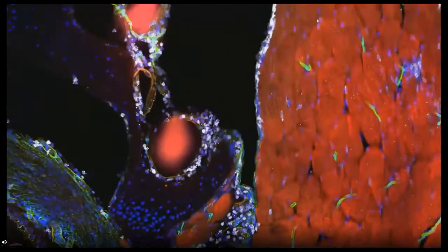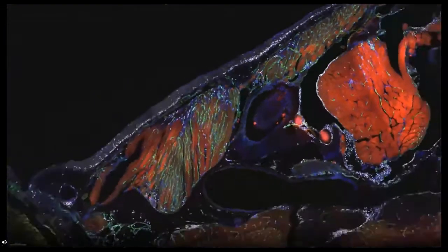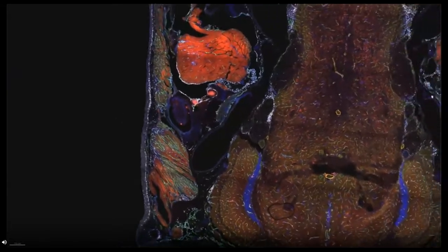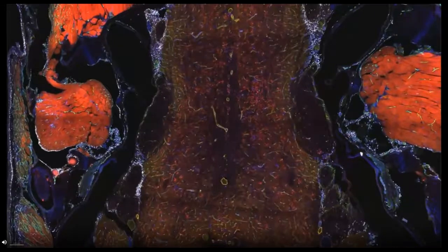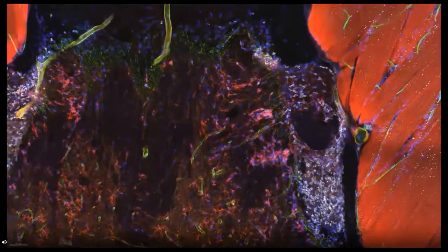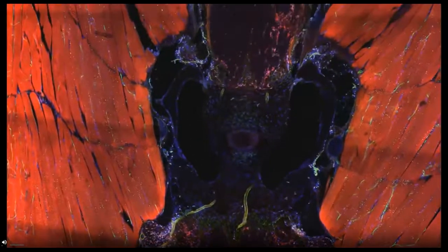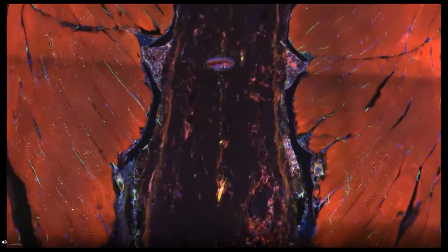You can see all the vasculature in the muscles, which are highly vascularized. And then again, the video will focus on the parts which are infected by this parasite. You can see all these parts here, they're full of parasites, and what you see here is full of spores. If you continue, you will pass the vertebrae right here, and then continue to the spinal cord, where you can also see sacs of spores among all the T cells around.